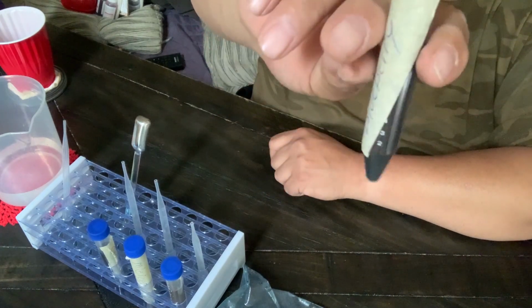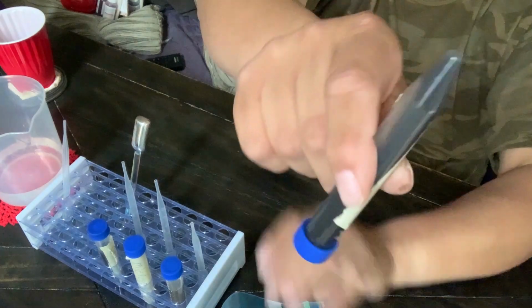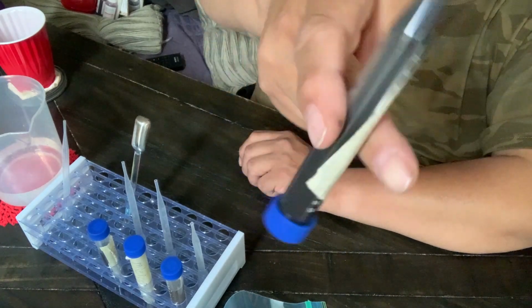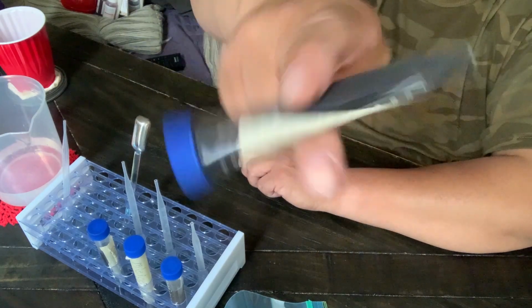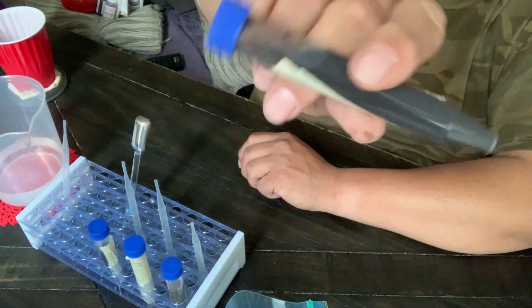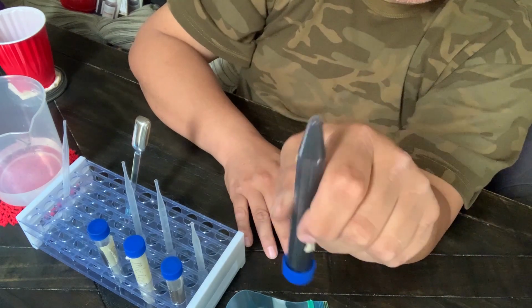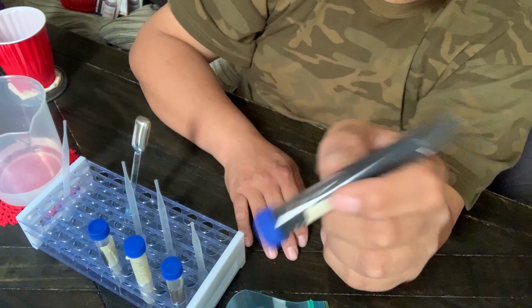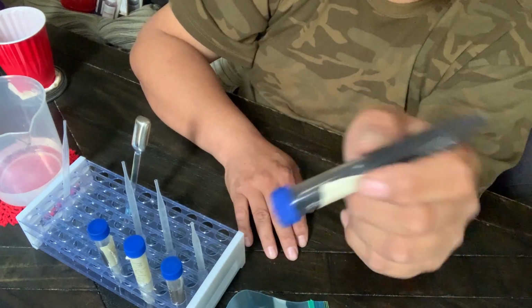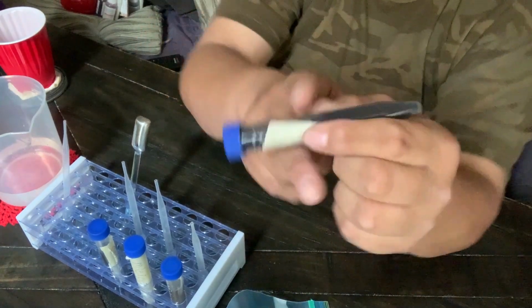and then you guys can do the same thing. If you'd like to send me a sample of your soil, I have to do exactly how you're seeing me do it here, and I have to tell you how many microorganisms you have per square foot, and possibly identify what kind of microorganisms you have. And depending on the plant you're growing, whether you have the right organisms. So we'll test this out and we'll find out. That should be the next step. So the next step will be at the microscope.